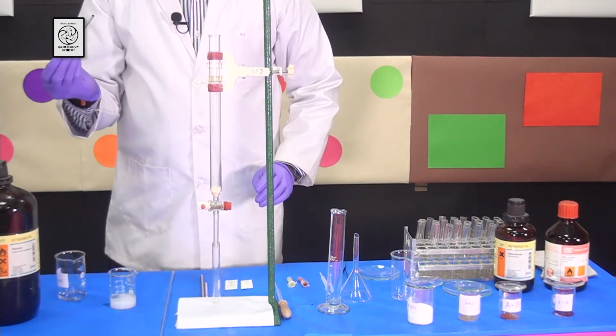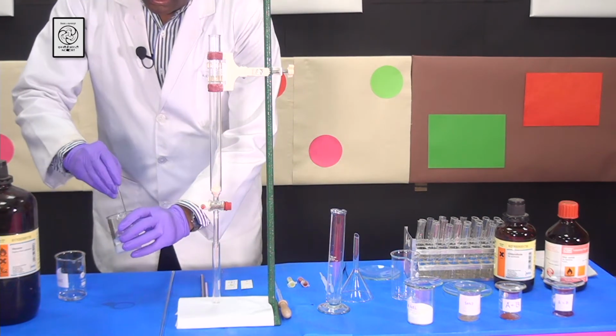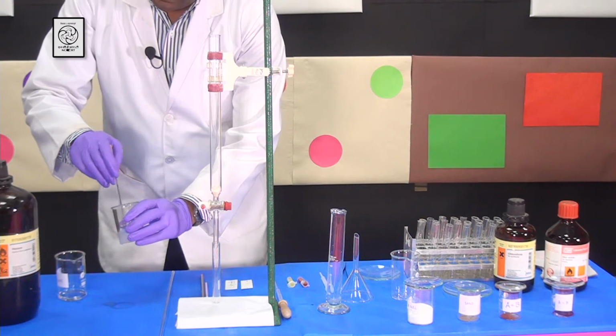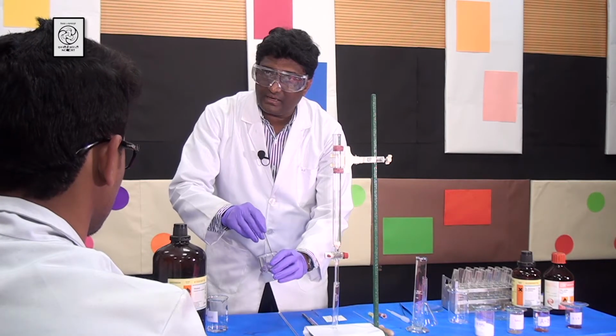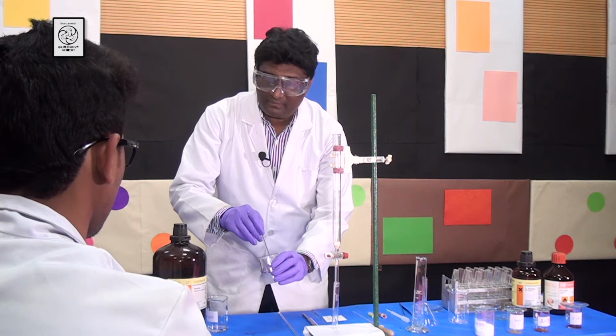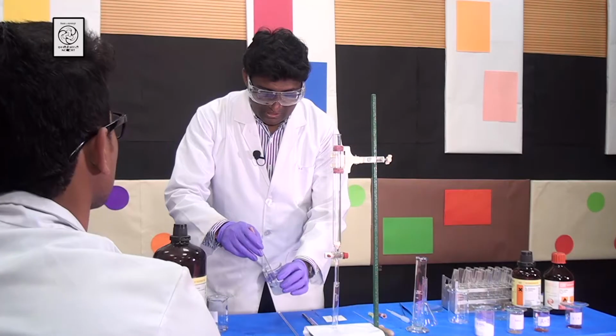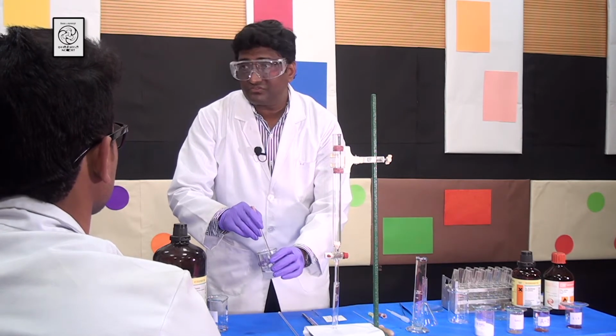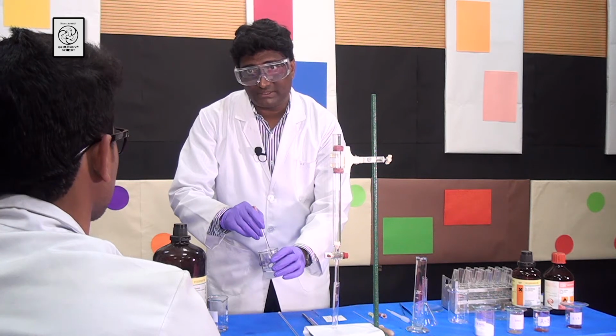Now I take a glass rod and stir it nicely so that I can make a slurry of silica gel. Sir, why are you stirring it? Oh, we stir it in order to get rid of the air bubbles, and also the silica gel will mix uniformly with the solvent. Okay, sir.